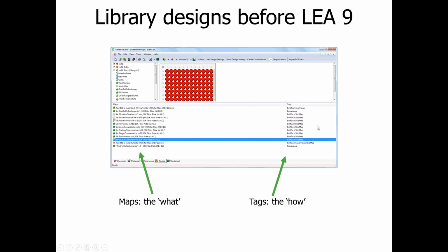The tag information, as we've added devices over the years and added features that have been requested by customers overall, the number of tags has increased dramatically. The challenge with the tags is that you see all of the tags, even tags that are not specific to the automation system that you're using. You also have to remember the tags, or sort of know what the tags are, before you start to use them. So this requires a level of complexity in terms of a number of things.